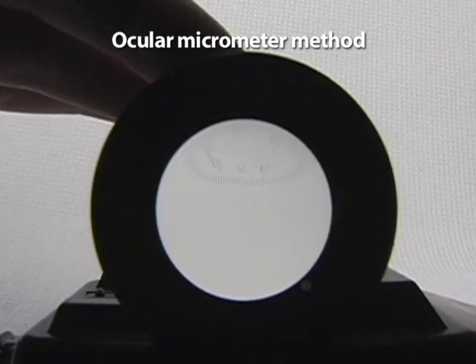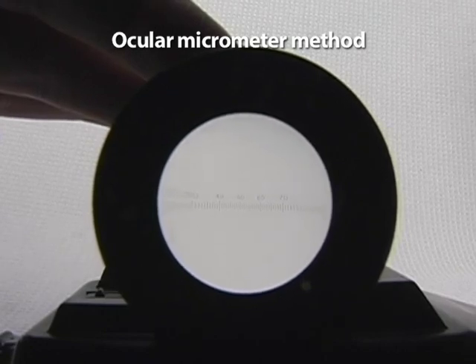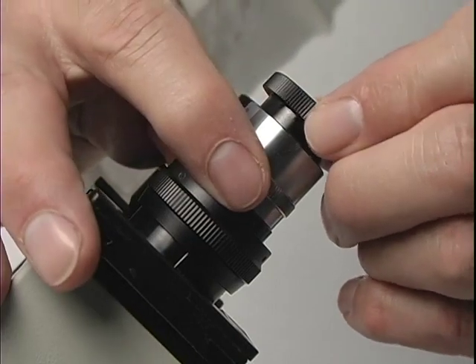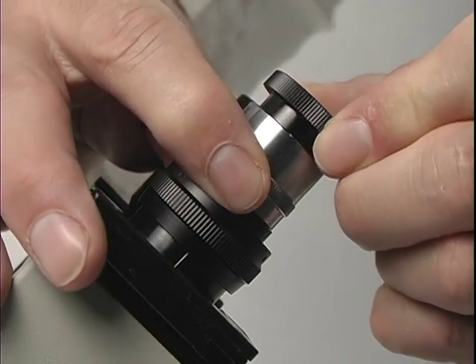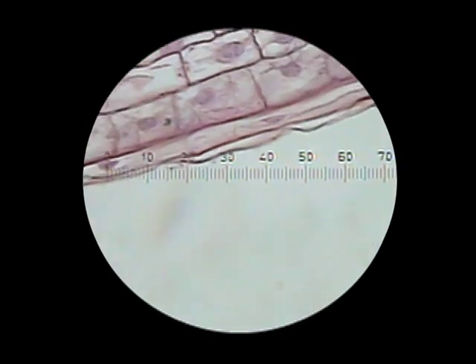The ocular micrometer method uses an etched piece of glass that is inserted into an ocular lens. Such an ocular lens often has a focusing mechanism to allow one to see clearly the ocular micrometer as well as the microscopic image of the object being viewed.